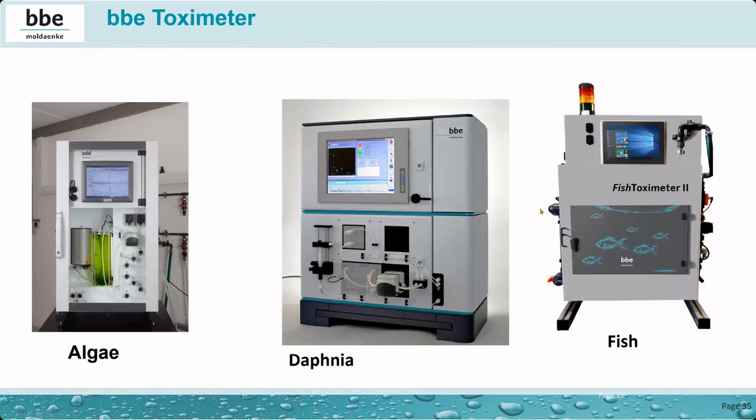We also have some toximeters, but that is not part of this. Algae, Daphnia, and fish toximeter.